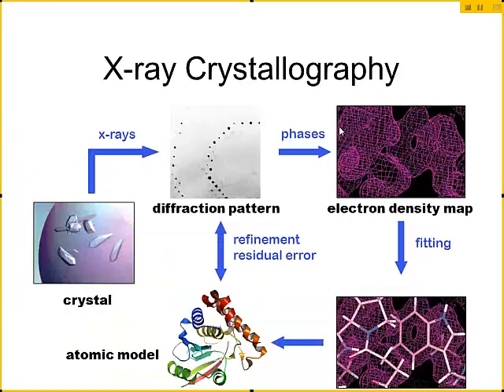Deciding which structure you want to use. But there is other information about X-ray crystallography that you should understand when comparing structures, so you can tell which structure is most suitable for the analysis you want to do. Now, X-ray crystallography here, I'm just going to give you a brief introduction.